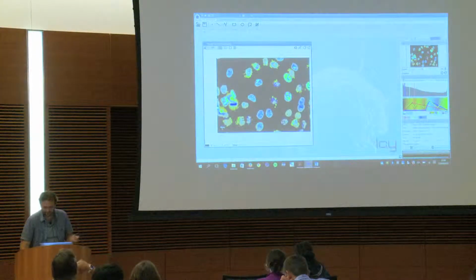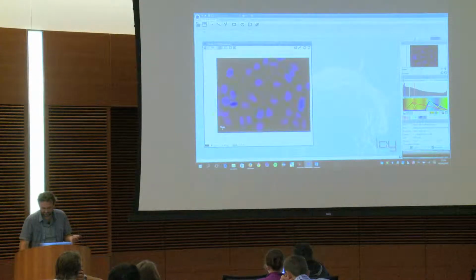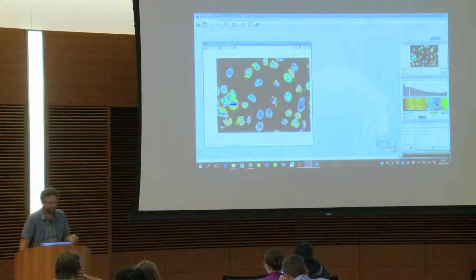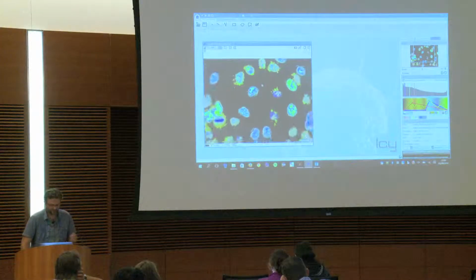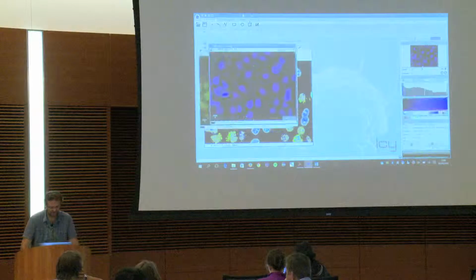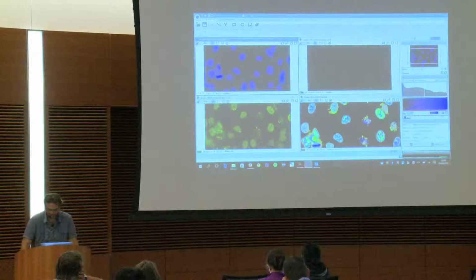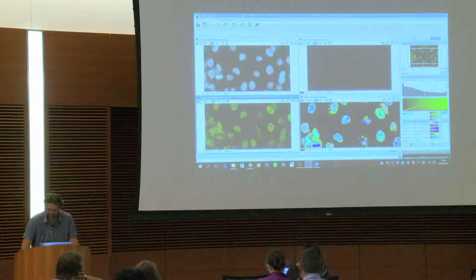Okay, and if you want to disable the rendering of a channel, you just tick the channel. So the other thing concerning the viewer is that, okay, I'm watching this and I want to extract all the channels, as I was saying. And then for all those, you can go back to a gray view if you wish.